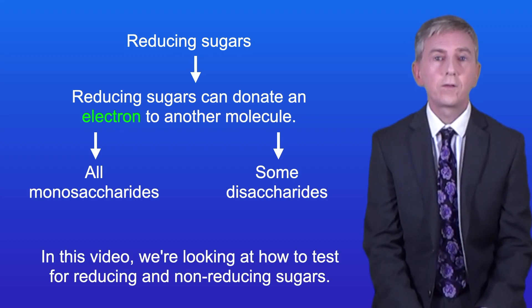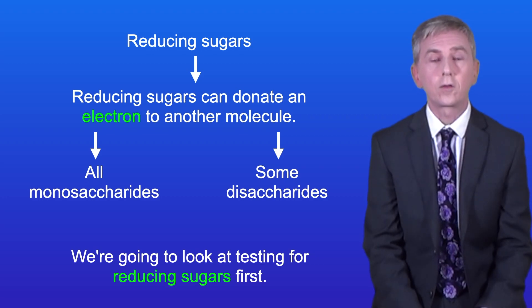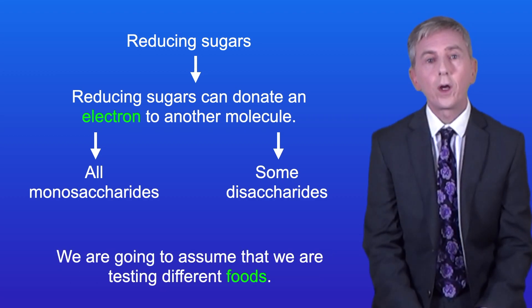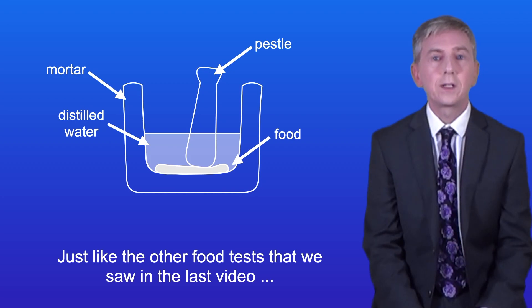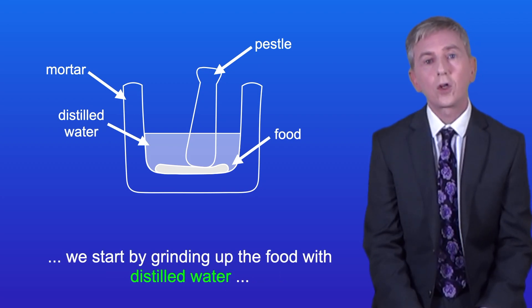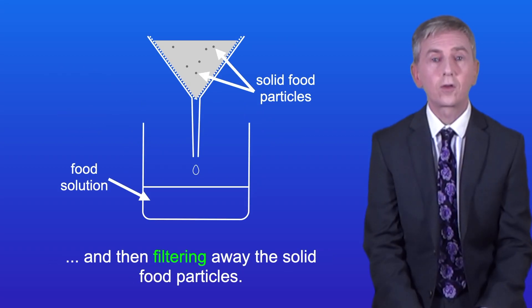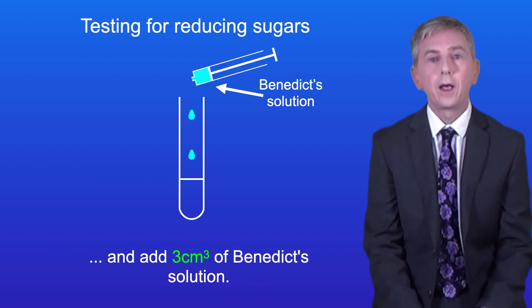In this video we're looking at how to test for reducing and non-reducing sugars, starting with reducing sugars. Remember that safety goggles should be worn throughout this experiment. We start by grinding up the food with distilled water and then filtering away the solid food particles. We then place three centimeters cubed of our food solution into a boiling tube and add three centimeters cubed of Benedict's solution.